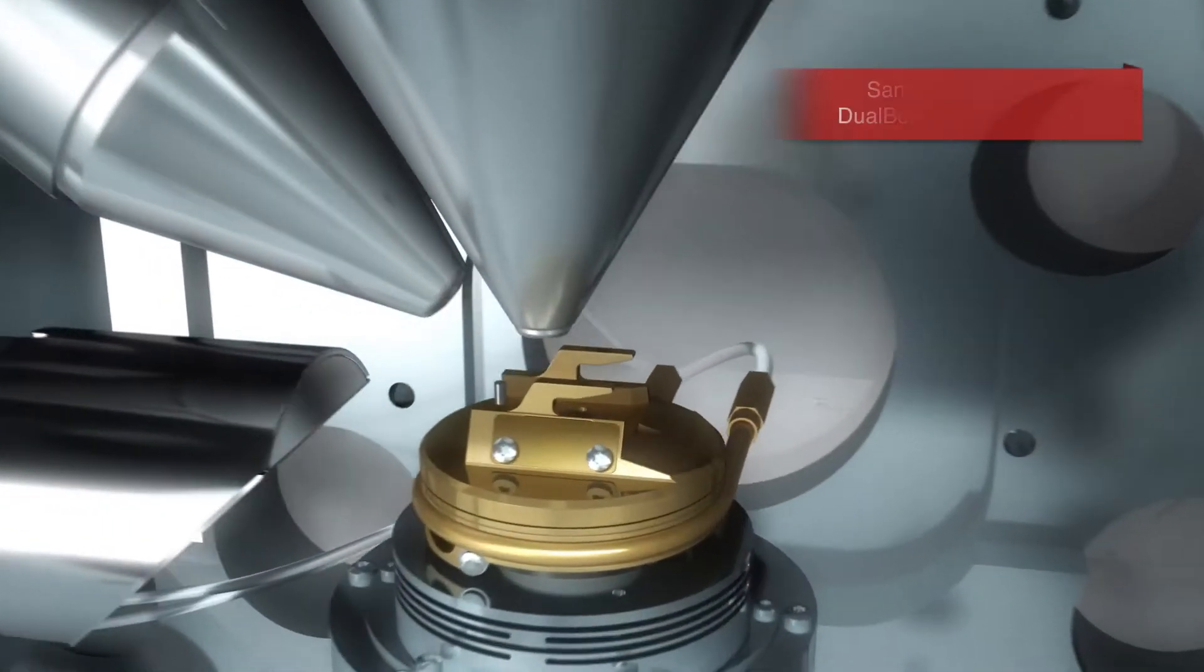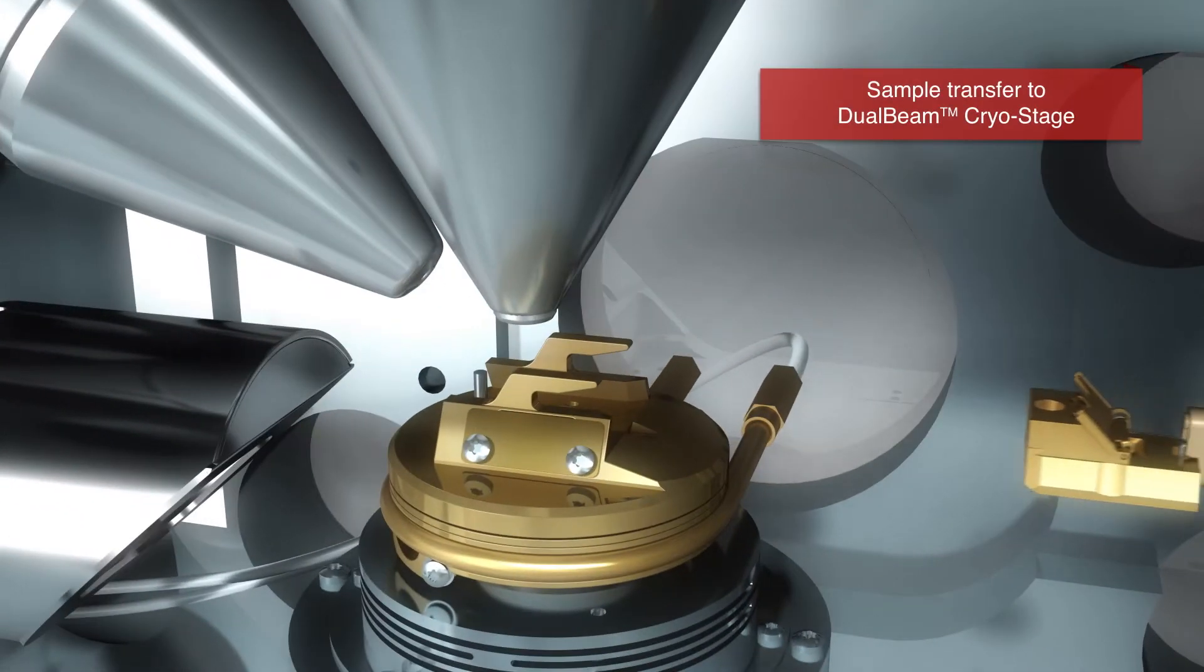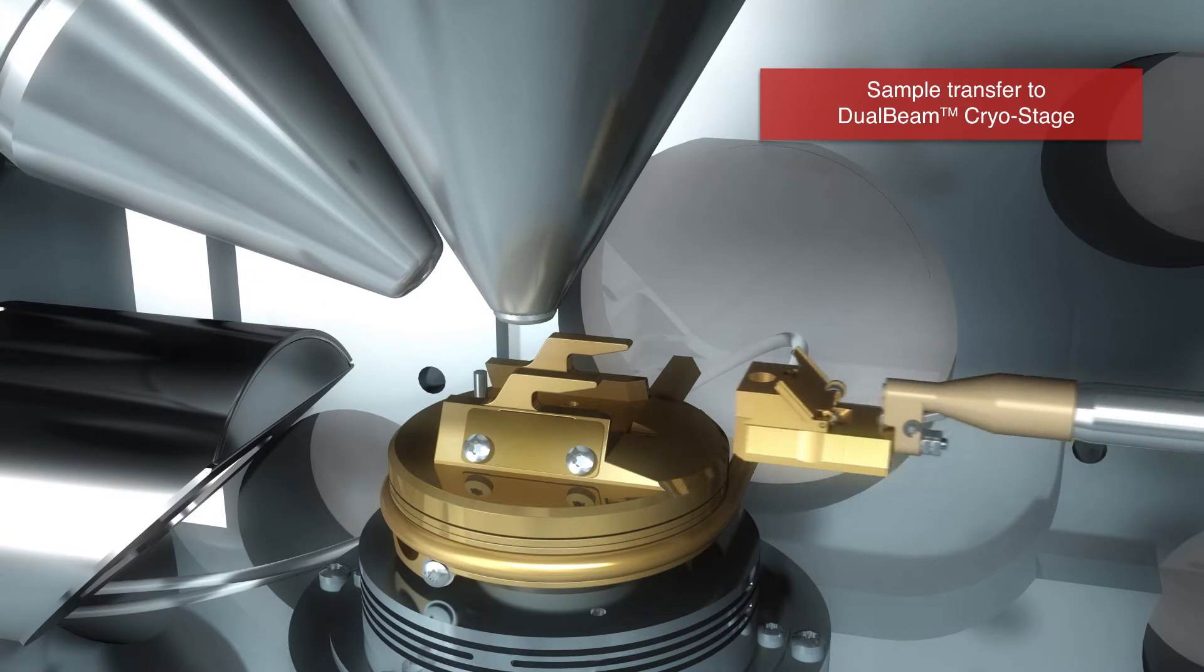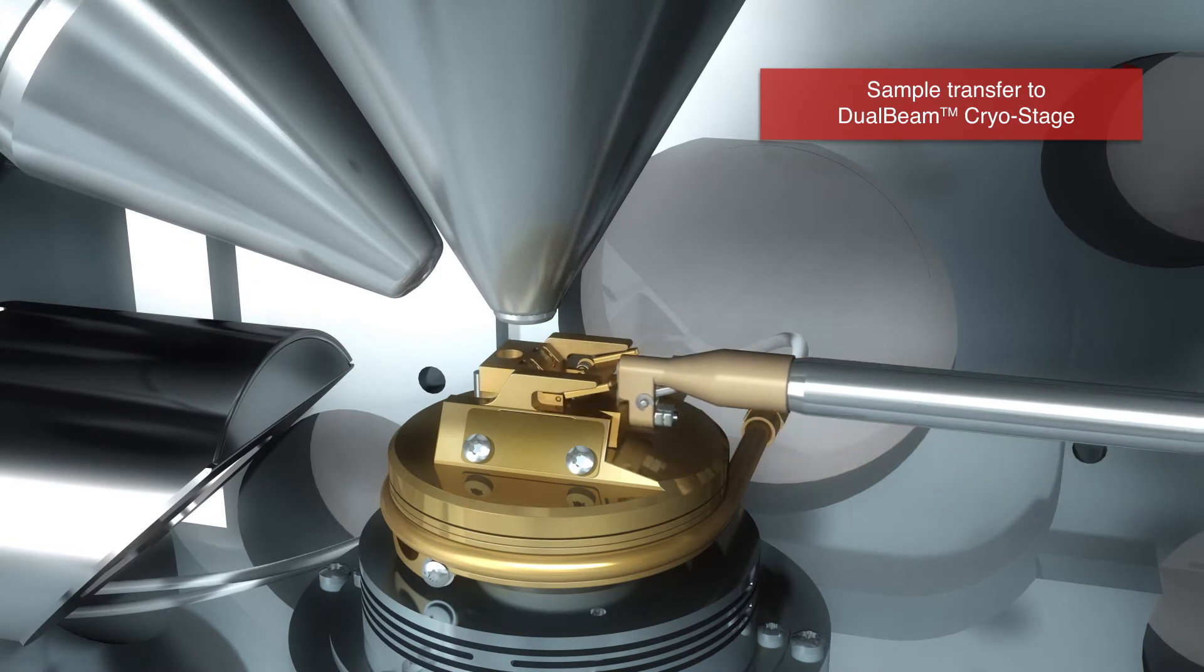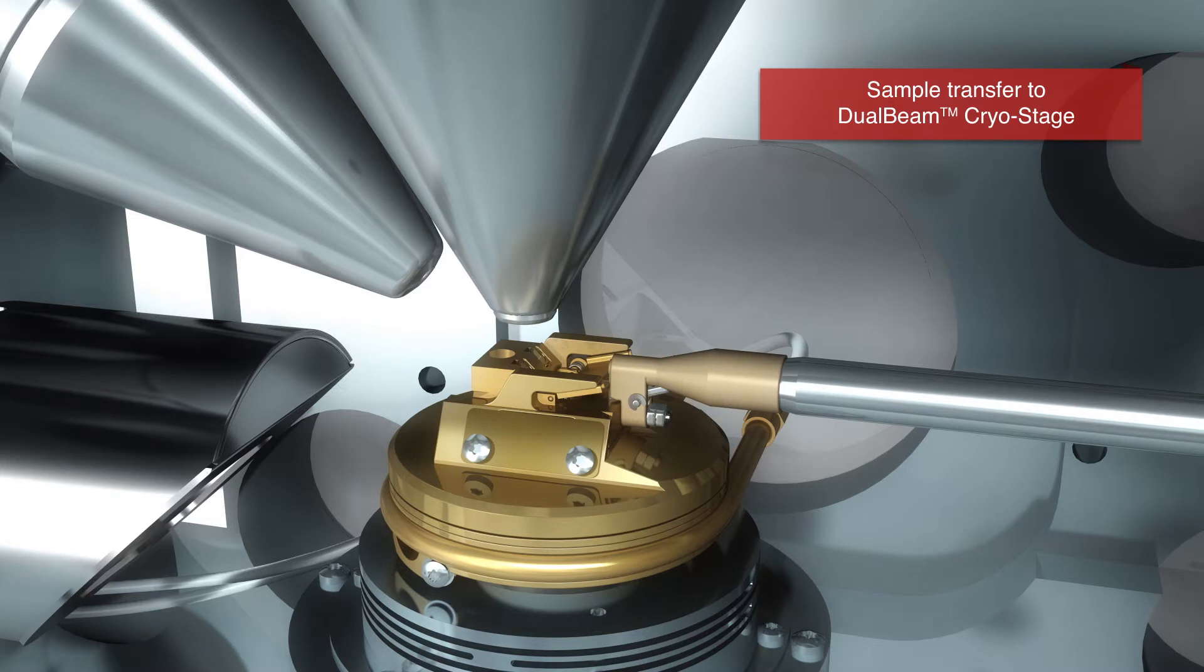For preparation, the frozen EM grid is mounted on a cryo holder and loaded onto the cryo stage. The Aqualose system ensures cells are kept vitreous at cryo temperature during loading and fib milling.